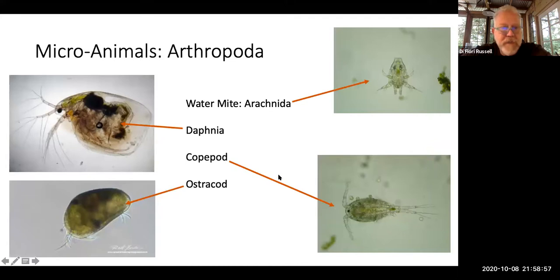So it might be, yeah, that's right, that you find things a little bit bigger and more complex than the single-celled eukaryotes. And indeed, there are a lot of microscopic animals. There are many different arthropods, for example. Arthropods, so kingdom Animalia. Arthropods is a phylum, Arthropoda. And it has the key factor there. And in fact, the meaning of this name is jointed legs, jointed feet.